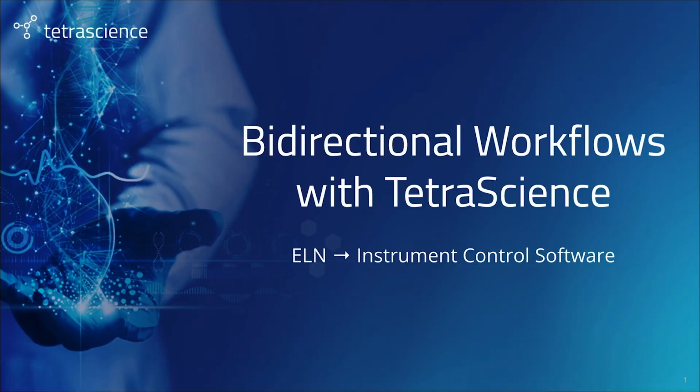Today I'm going to demonstrate how the Tetra Data Platform can be used to automate bidirectional workflows. The example we're going to be looking at is receiving data from an electronic lab notebook, an ELN, and sending it to some instrument control software.